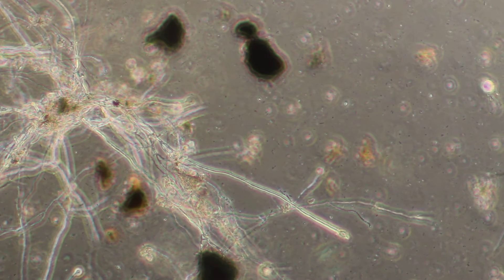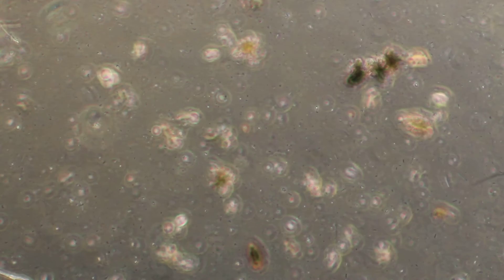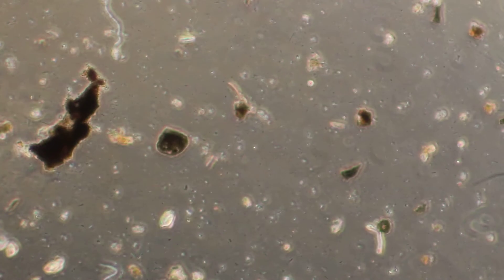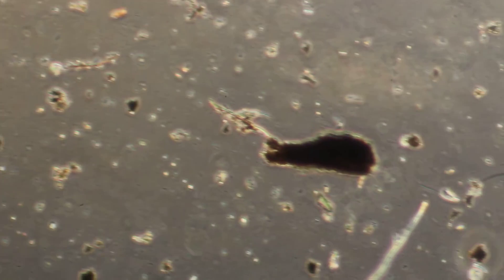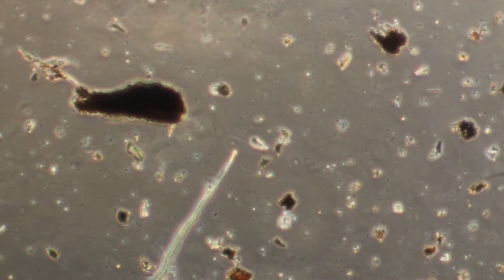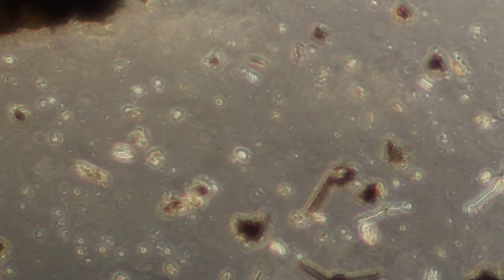In general, I'm seeing a lot of strands starting. When I'm comparing this to compost, which should naturally be higher in microbial activity than a soil mix, we're putting a lot of stuff in our soil — a lot of nutrient sources and ingredients as a way of hopefully increasing that microbial activity in our nutrient cycling.